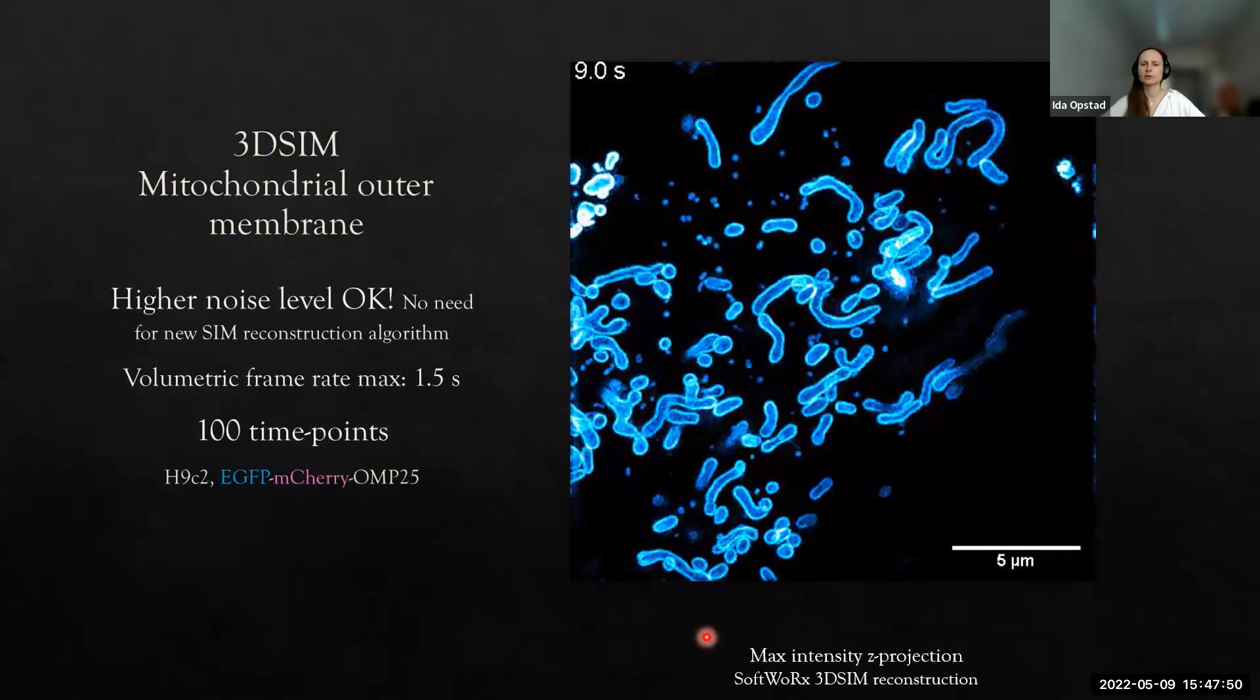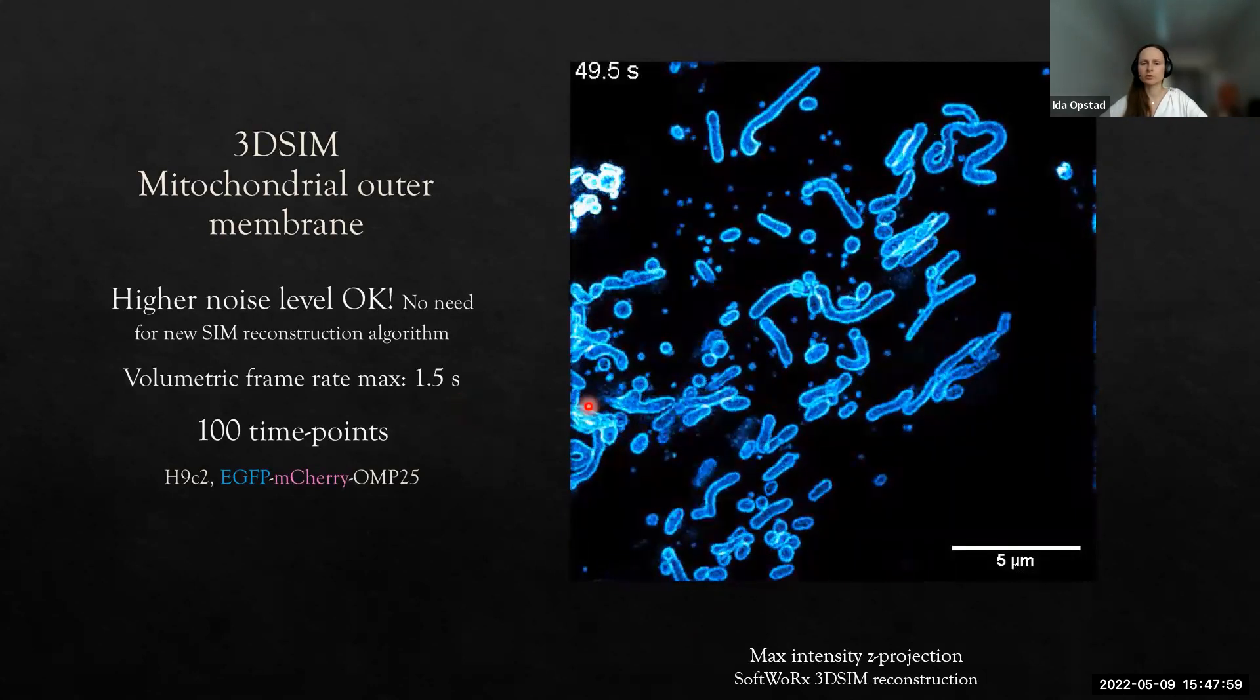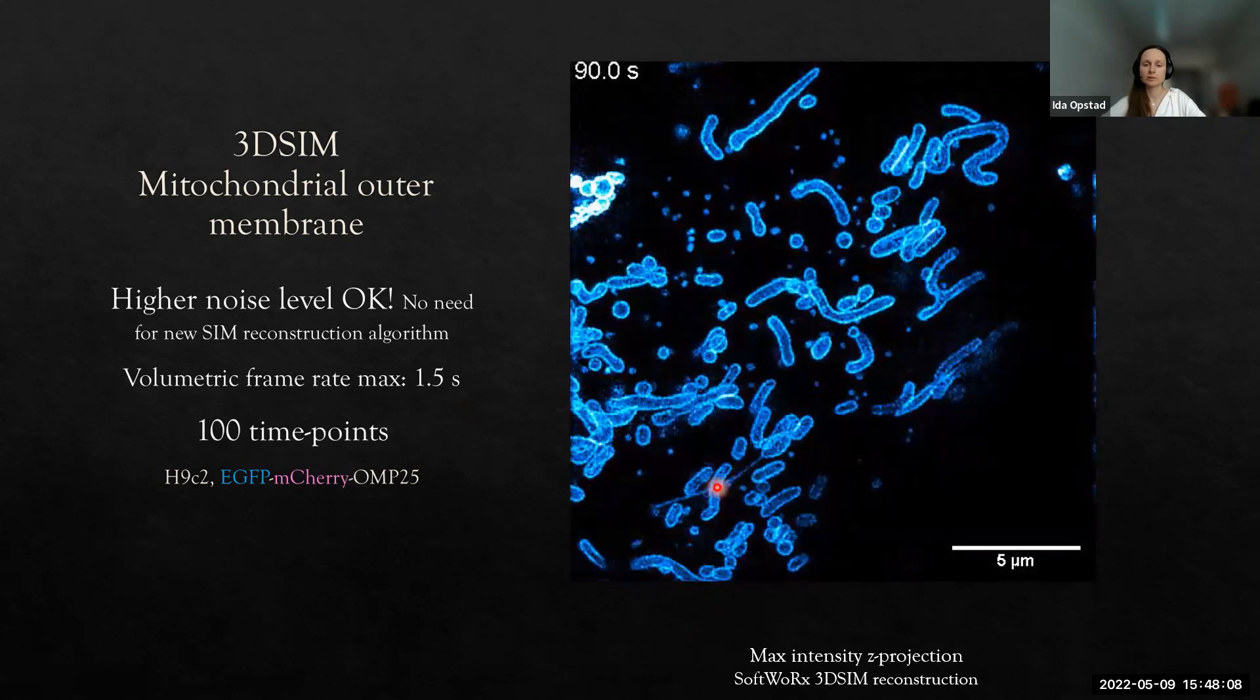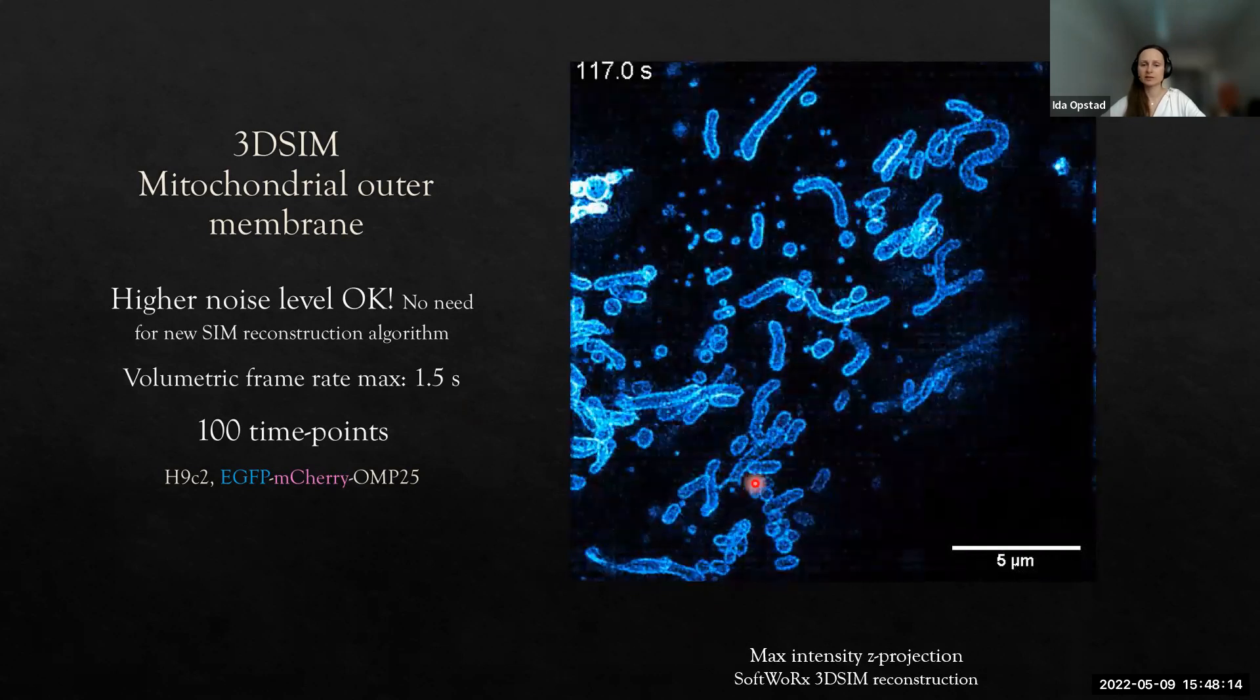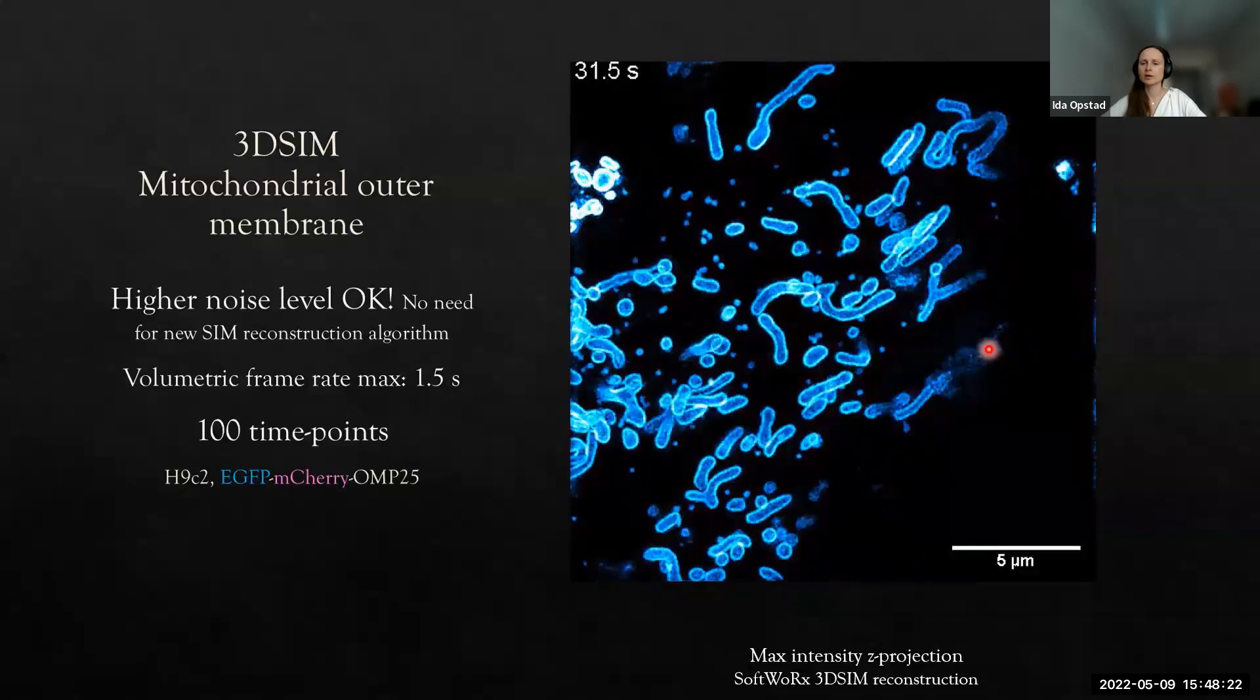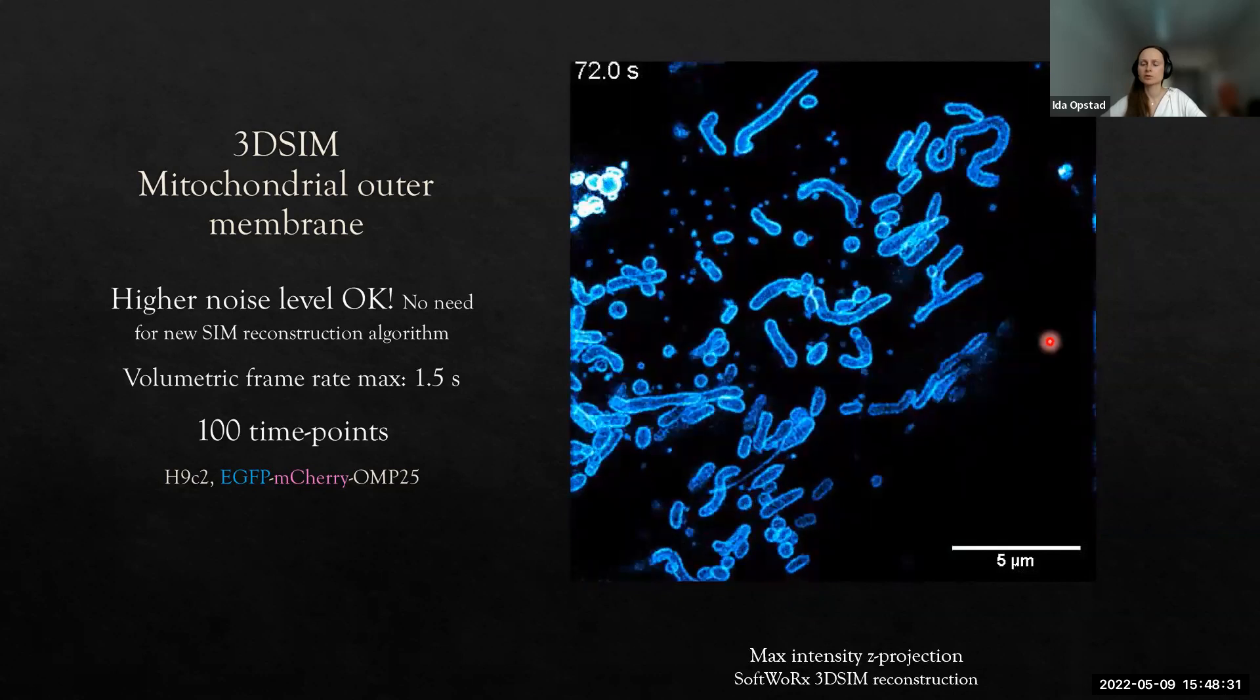This is an example of a time-lapse then, as fast as possible. I got a volumetric imaging rate of 1.5 seconds. You can quite nicely see the dynamic of the vesicles and even these weird mitochondria tubules coming out, stretching far and wide and retracting very rapidly. You can also see the Z stacks maybe a bit less than it should have been because the mitochondria go out and in of the field of view. It just goes too high or too low.